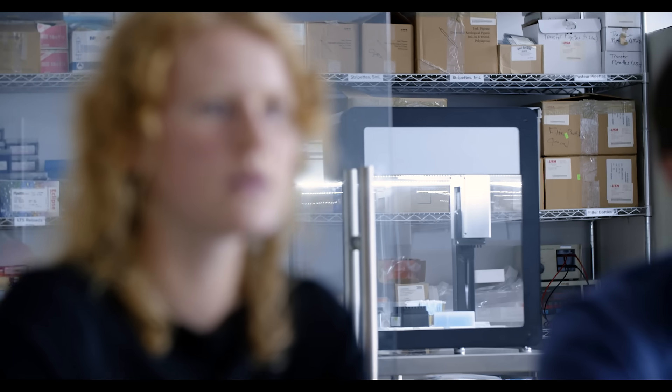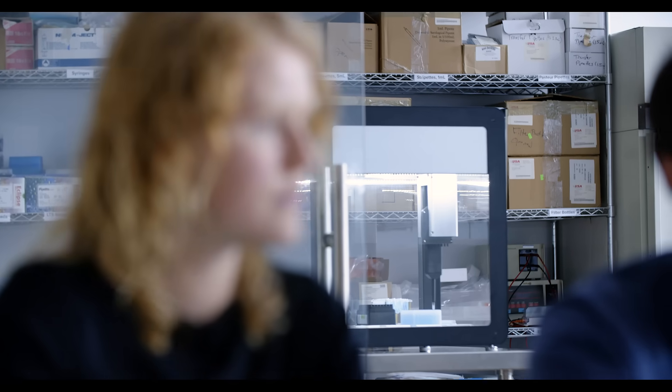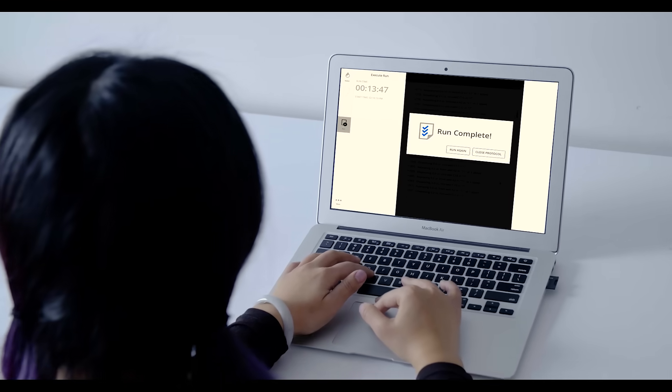Except you don't have to run it yourself. With the OT2, you can run a protocol from the other room over Wi-Fi. You can check on the progress of a job remotely and queue up more protocols to run.